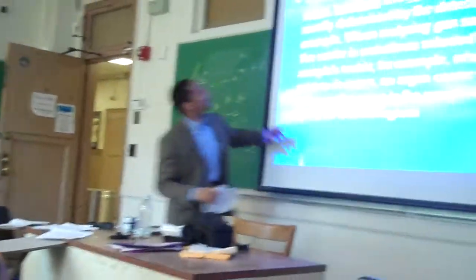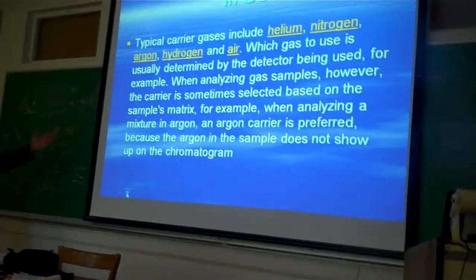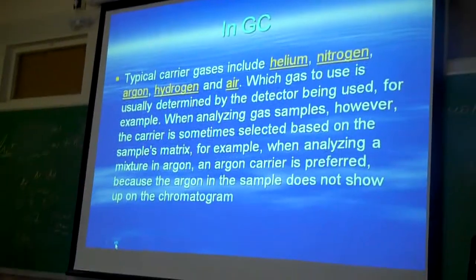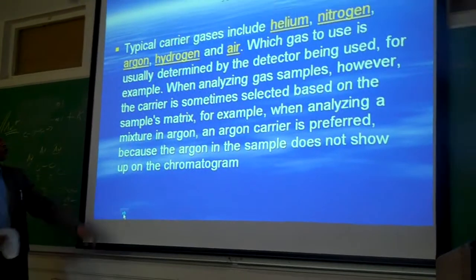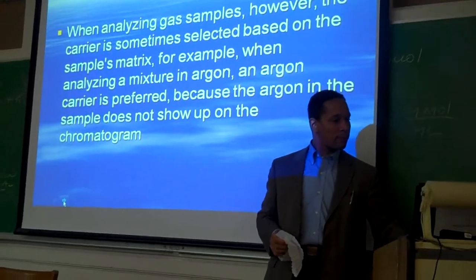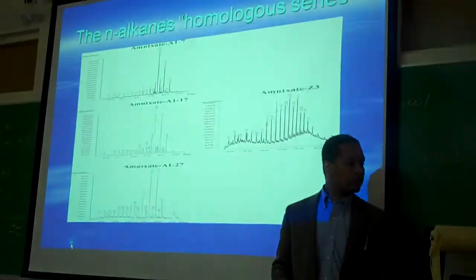And in a GC apparatus, you'll have some carrier gas. If you go on to instrumental analysis, you'll have a carrier gas. It'll be a larger instrument, helium, nitrogen, argon, some inert gas. Argon gas is usually used. And these gases don't show up in the detector.